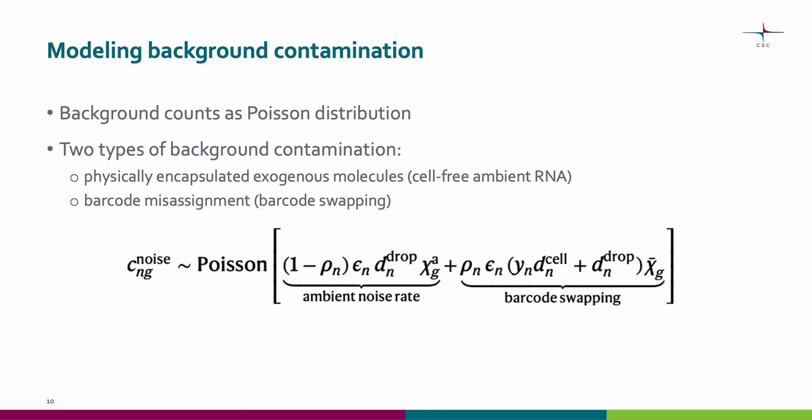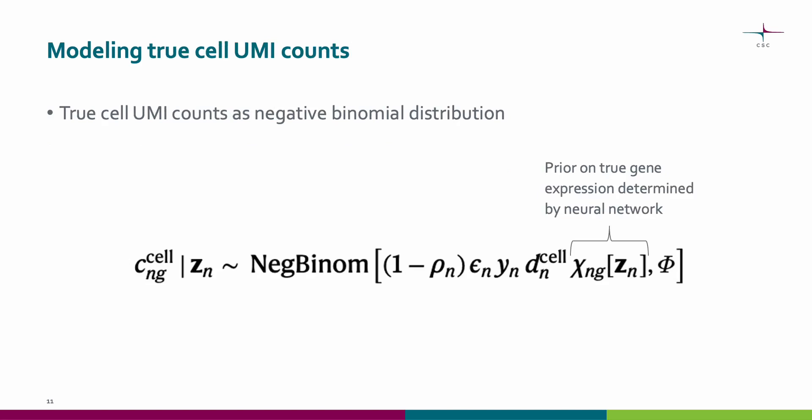These two different processes could lead to two different types of background profiles. If the source of contamination is cell-free ambient RNA, each droplet should contain a small sample of this ambient RNA background profile. However, if the source of contamination is related to barcode swapping, swapping events occur at random, and it would be expected that the background profile related to barcode swapping would be exactly the average of all of the RNA sequenced in the experiment. The true UMI counts for each cell are modeled as a negative binomial distribution where the rate depends on several parameters, including a prior on true gene expression rate. A neural network is used to learn a droplet-specific latent variable that determines this flexible prior.